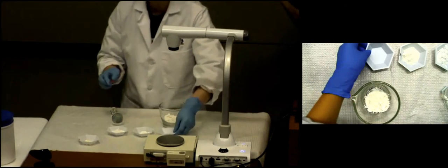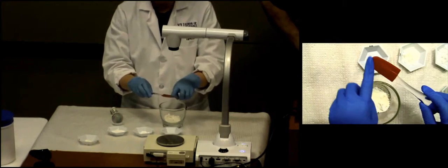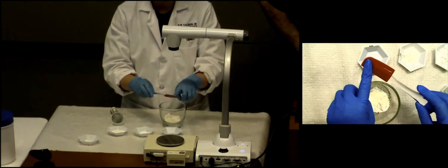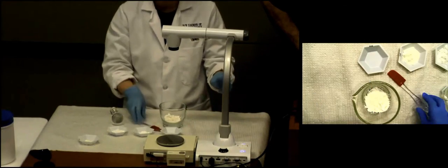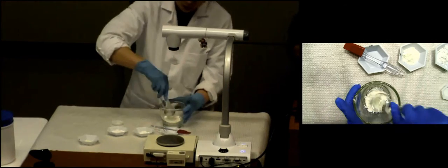Okay. All right. One little trick I want to teach you is today you will see in your lab a lot of drug accumulated over here on your rubber spatula. So rather than just lay it on the bench, you probably want to set it on the weigh boat. So therefore, you don't lose any drug.